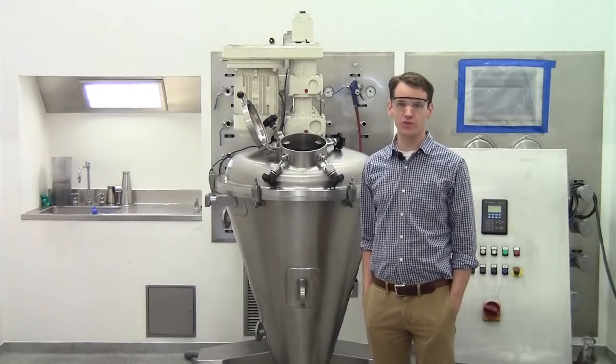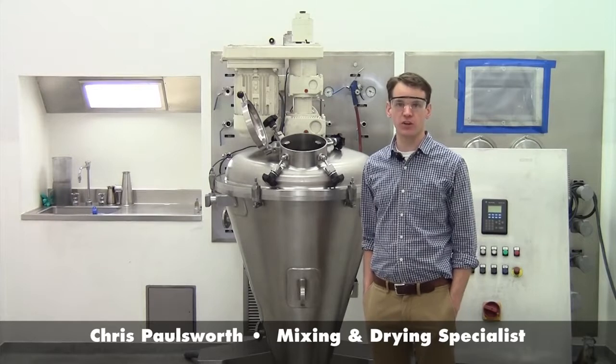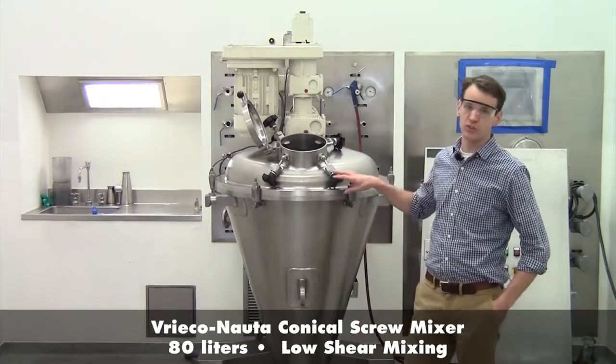Hello and welcome to today's demonstration. My name is Chris Paulsworth and I'm a mixing and drying specialist here at Hosokawa Micron Powder Systems in Summit, New Jersey. Today we'll be discussing our Vrico Nauta conical screw mixer.